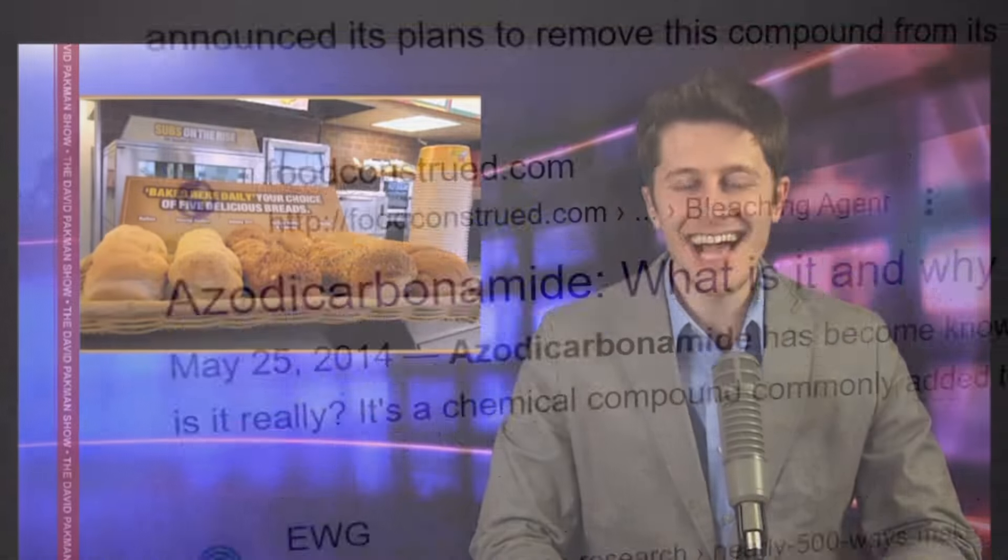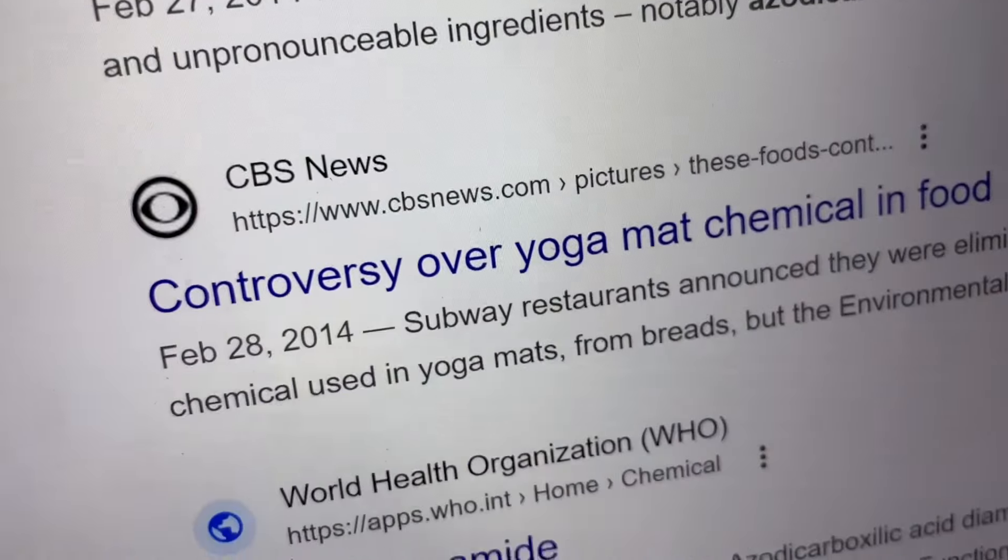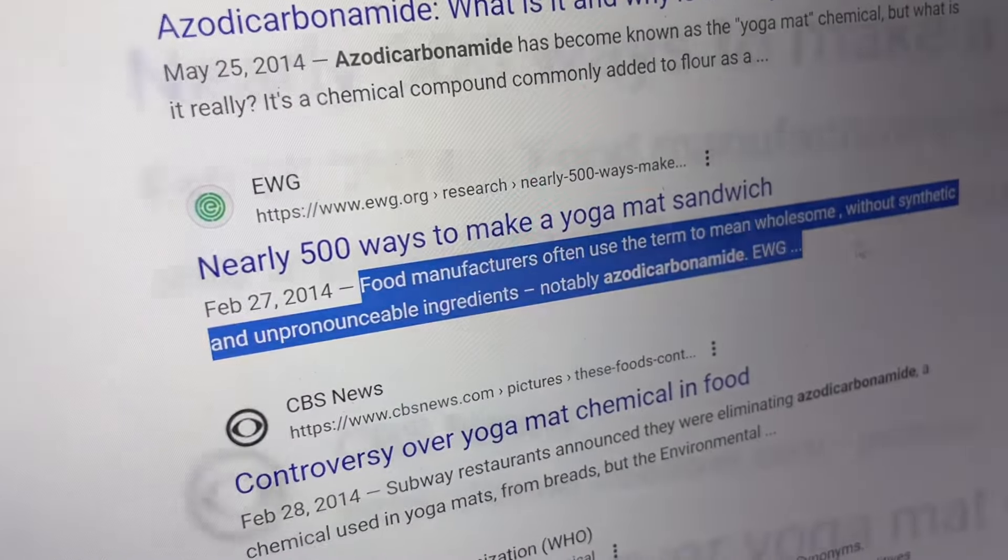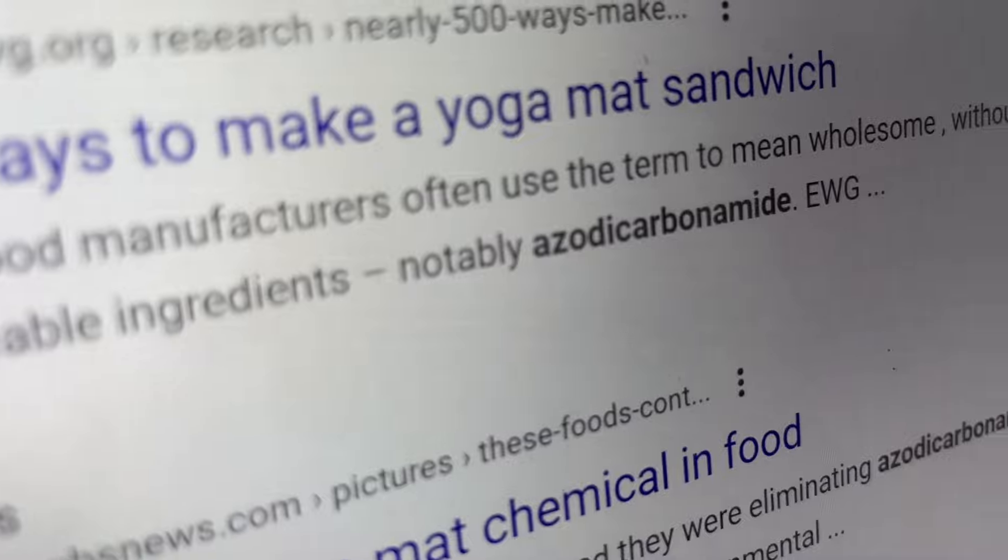This is an ingredient that is also found in yoga mats and shoe soles to add elastic ingredients that is also found in yoga mats. It's the same stuff they use to make yoga mats in the bottom of your shoes.